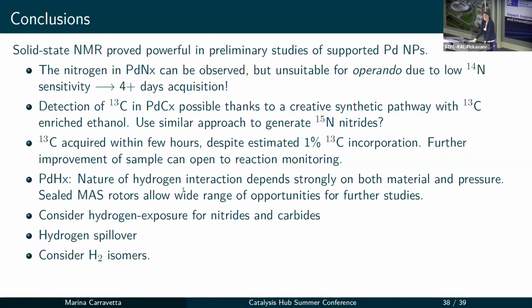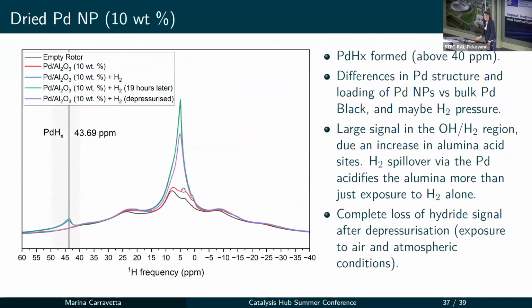I was fascinated by your palladium hydride studies because palladium hydride is really interesting from a catalytic point of view. Obviously they're quite tricky. The take-home message is that it's not as easy as the carbides and the nitrides, which is a shame because I was hoping it was going to be really easy. But if you have just palladium nanoparticles, you can get a lot of hydrogen into them, as you say, depending on pressure and temperature.